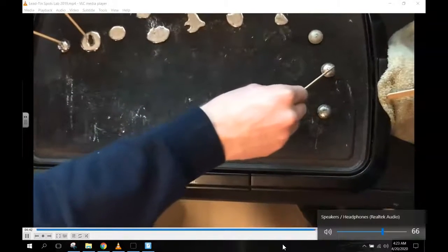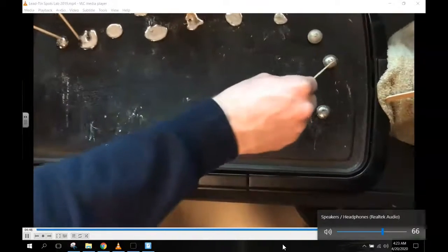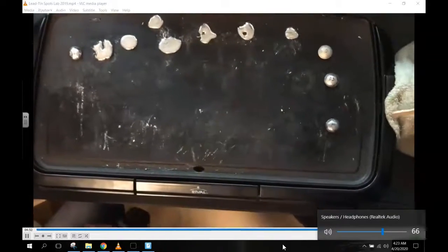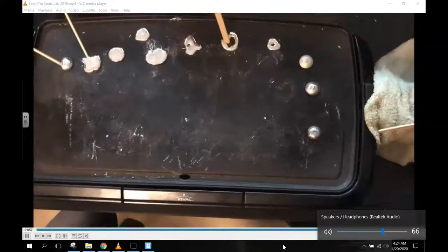Well, I think this is 6 right here. That's out of 5. That one's 5. This is 5 and this one's 6 and that one's 7. Oh, yeah, this one's starting to get shiny. 7, that's 5, 4, 6, I'm pretty sure. Really, Dylan? 5 and 6 got mixed up.